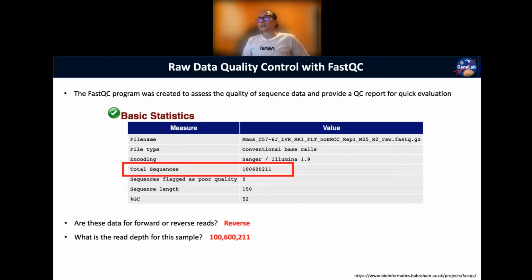This is helpful. So remember how I mentioned that in flow cells you have multiple lanes. So sometimes when you get your FASTQ files back from a core, they might not have put all of the sequences from each one of those lanes together. And so they might give you 4 sets of FASTQ files per sample. And then you'll have to combine them together with the cat command that we went over in the intro Unix, and you can check the line count with the command that I didn't go over, wc with the option -l, that'll count the number of lines in a file.